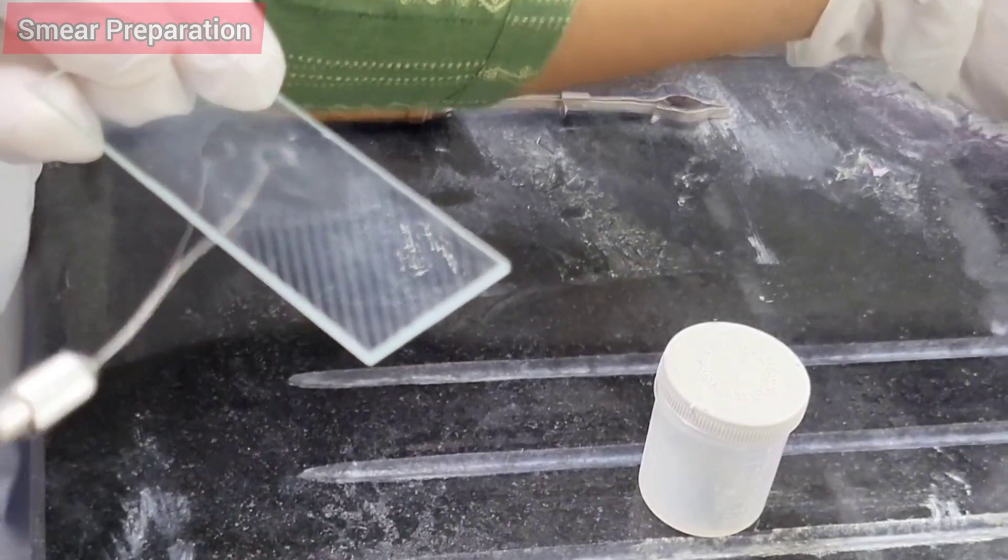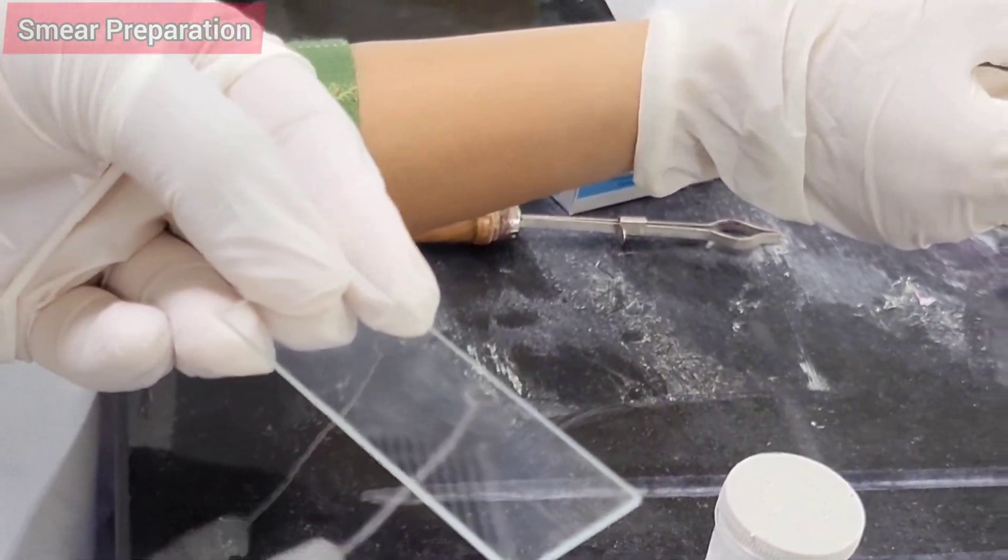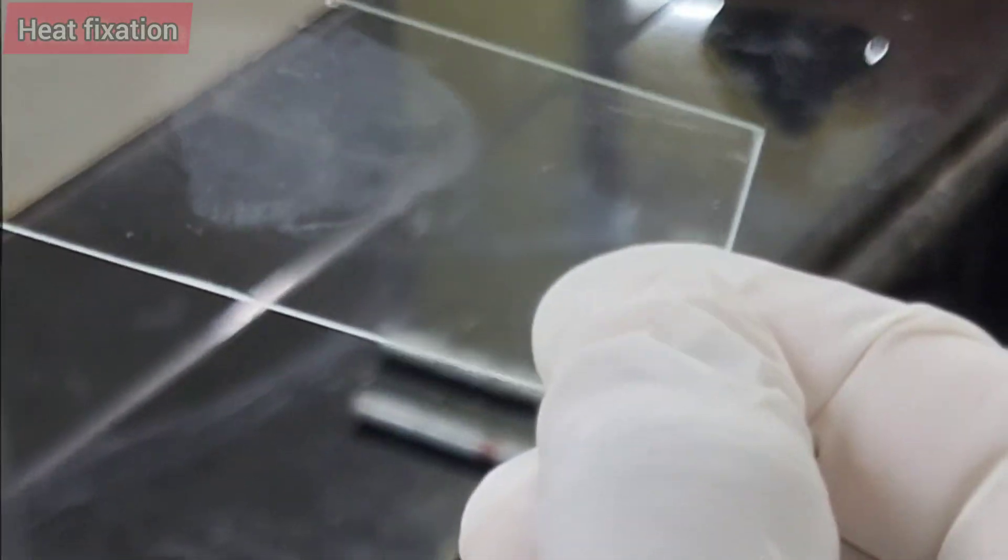Other specimens can be used: pleural fluid, CSF, and tissue biopsies. Next step is heat fixation. After air drying, the slide should be passed over the flame four to five times.